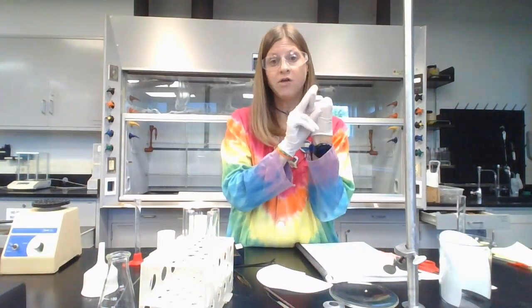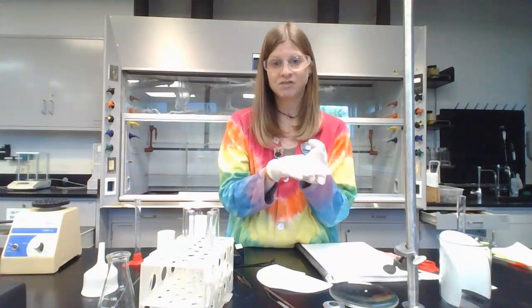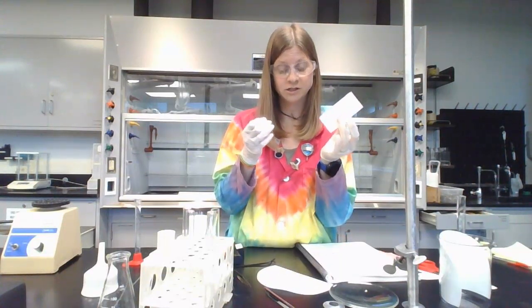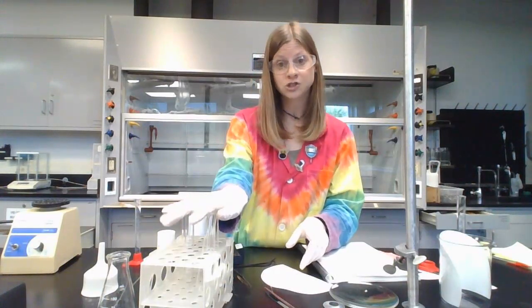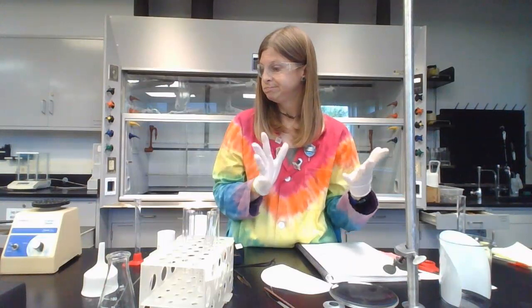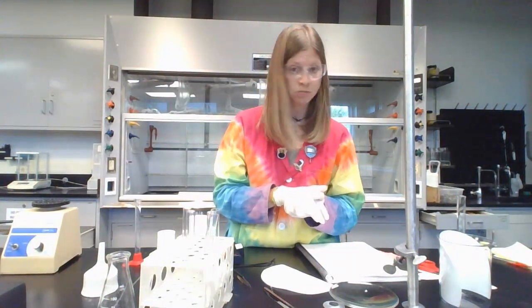So we've got solid and solid filter paper, iron, and everything else waste containers. Then we've got our broken glass things, our TLC plates and our micropipettes. And everything else gets washed and put away. The test tubes are going to have a designated container for them to go to. Otherwise, you should be all good.